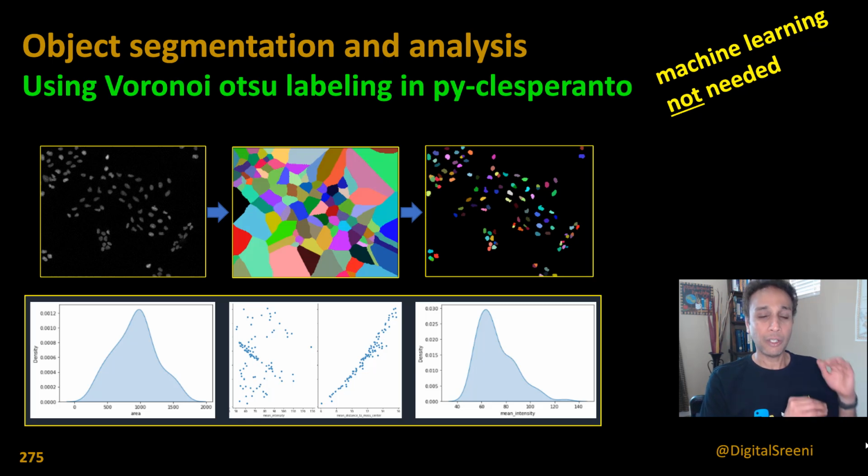Now that we understand exactly how that works, let's convert everything into a single line approach. That's it. One line, thanks to the pyclesperanto library. And again, no machine learning needed, because this is not a super duper complicated example. You're not trying to segment glomeruli in pathology images or segment satellite images for trees and roads. This is a pretty straightforward application where you have a background and a bunch of objects in the foreground, and what is the best method to segment them.